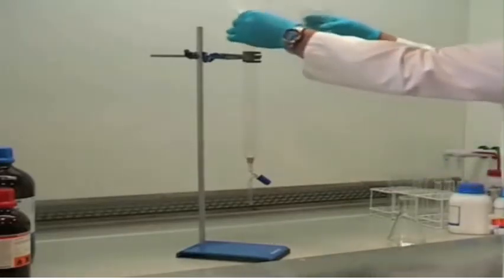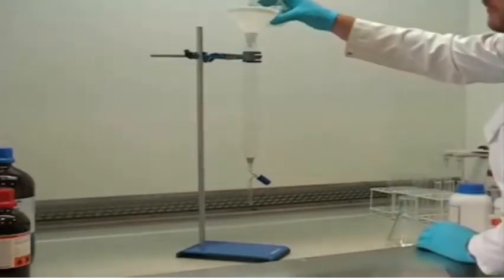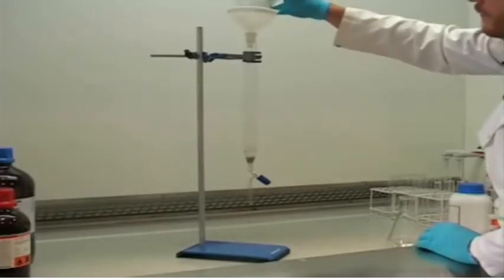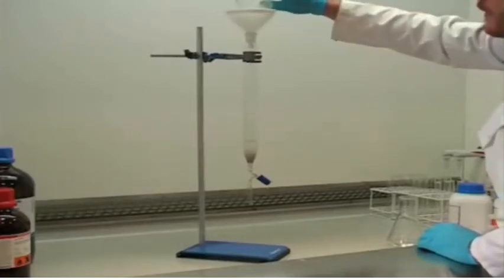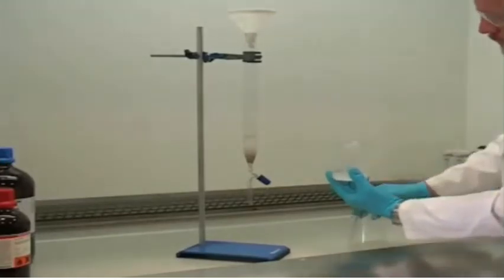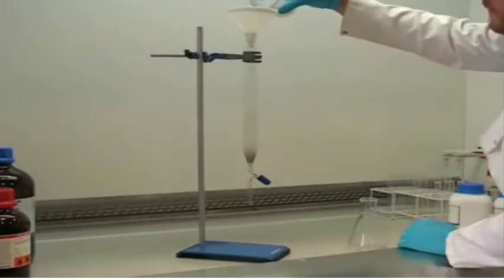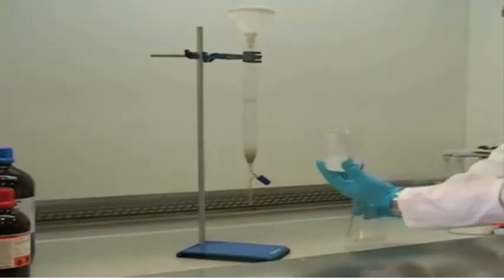Again, a funnel should be placed in the neck of the column to assist with pouring. And you will need to occasionally swirl the beaker to ensure that the silica doesn't settle out in the bottom of the beaker. Where appropriate, more eluent should be added to reform the slurry to assist with pouring. You may need to do this several times.